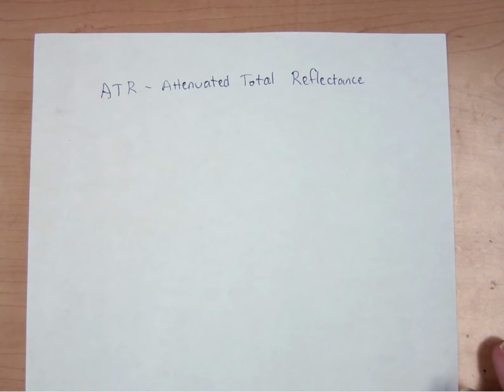this work. This is actually the sample holder that we have on both of our FTIR instruments in the lab that you should be using as part of your lab experience for this course. And so how does this work exactly?